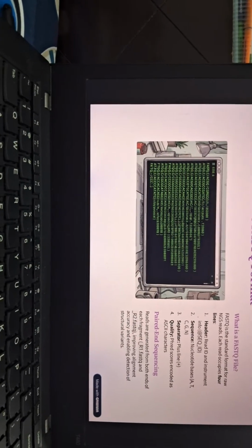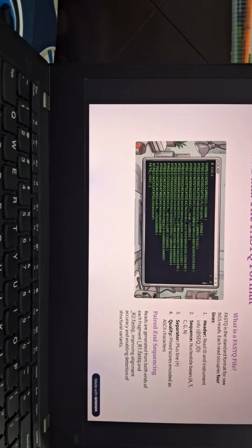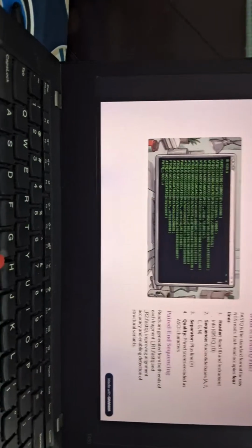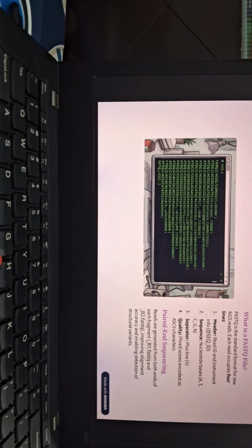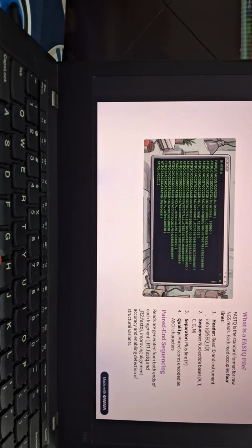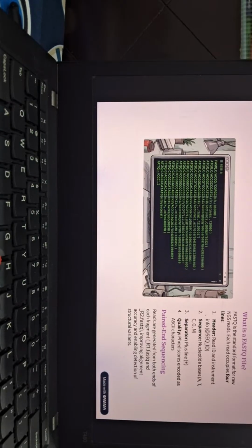After sequencing, we receive FastQ files. A FastQ file contains 4 lines for every sequencing read: the read identifier, the DNA sequence, a separator, and the quality score. Most RNA-seq experiments use paired-end sequencing, so each sample usually has 2 files, _R1 and _R2.